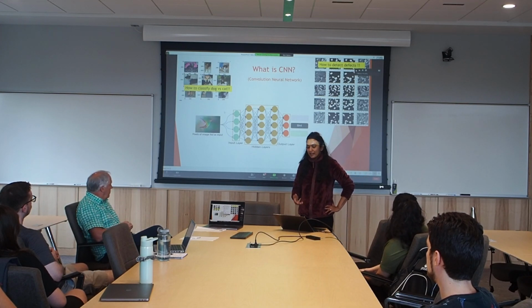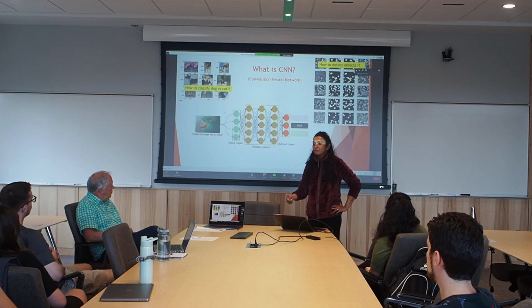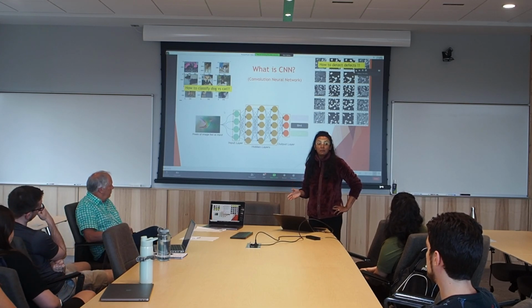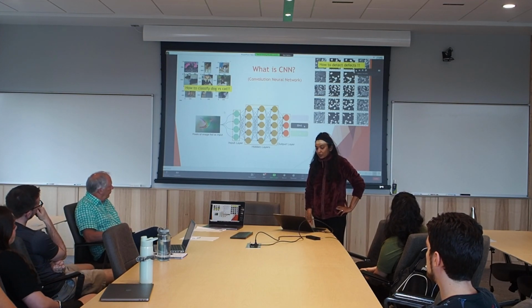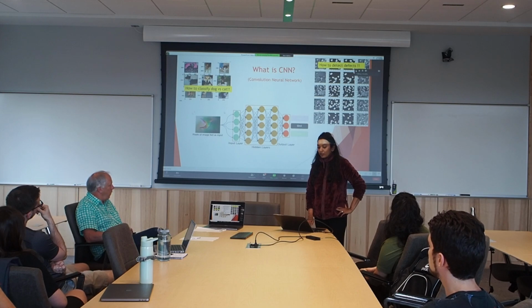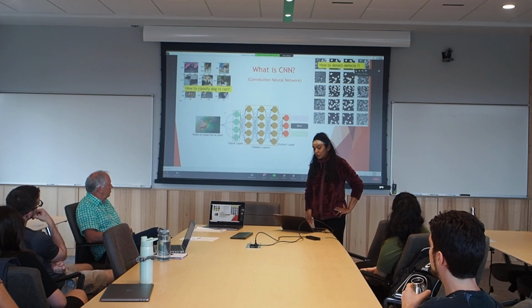Similar to that, in our case, I give an image consisting of voids, dislocations, bubbles, and it should be able to tell me whether it's a dislocation, a void, a helium bubble, an edge dislocation, or a precipitate. Why not? And I'm trying to create that system here. So to begin with, this is how a basic representation looks. You give your network an image like this, here of a bird, versus here you give it one of our microscopy.